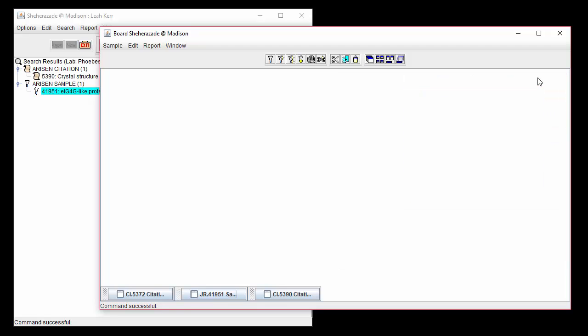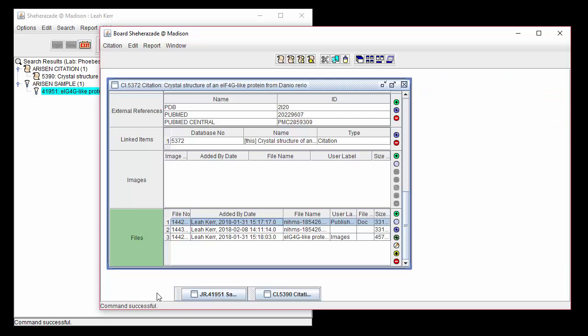Citation records in Sesame may also be used as a simple version tracking system for manuscripts, for example, because multiple instances of the manuscripts may be attached to a record. Teams do not even need to rename files because each upload is stamped with a username, timestamp, and a unique file number.